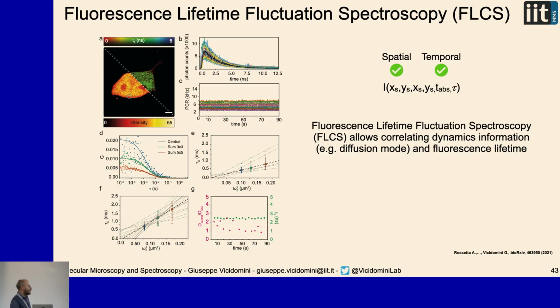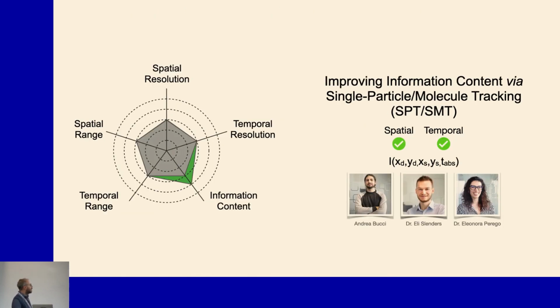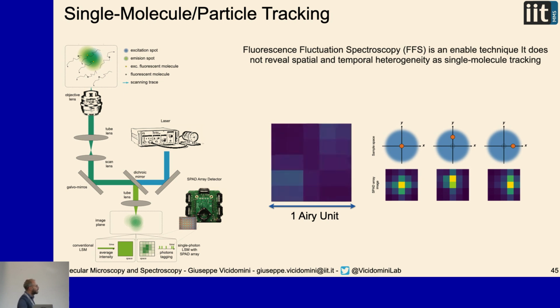Okay, obviously we can combine this information with the lifetime, and I want to go really fast to one last example. Fluorescence fluctuation spectroscopy is a wonderful technique, but it's an ensemble technique, again.